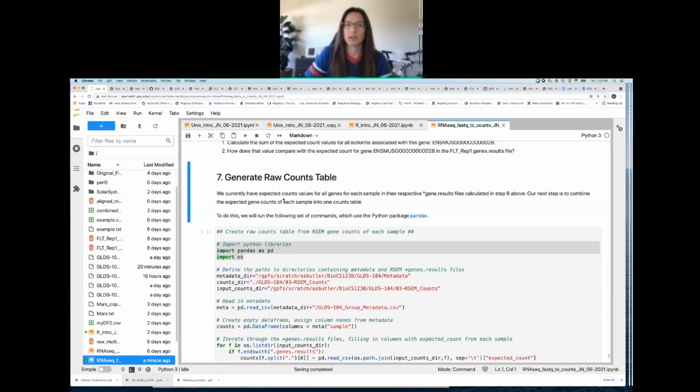So let's move on and let's put all of these count data together now. So remember, do you guys remember which file we use of the 2 counts files from RSEM for differential gene expression? You type it in the chat. So which of those 2 counts files from RSEM are we going to use for transcript? So it's actually the opposite, Diksha.